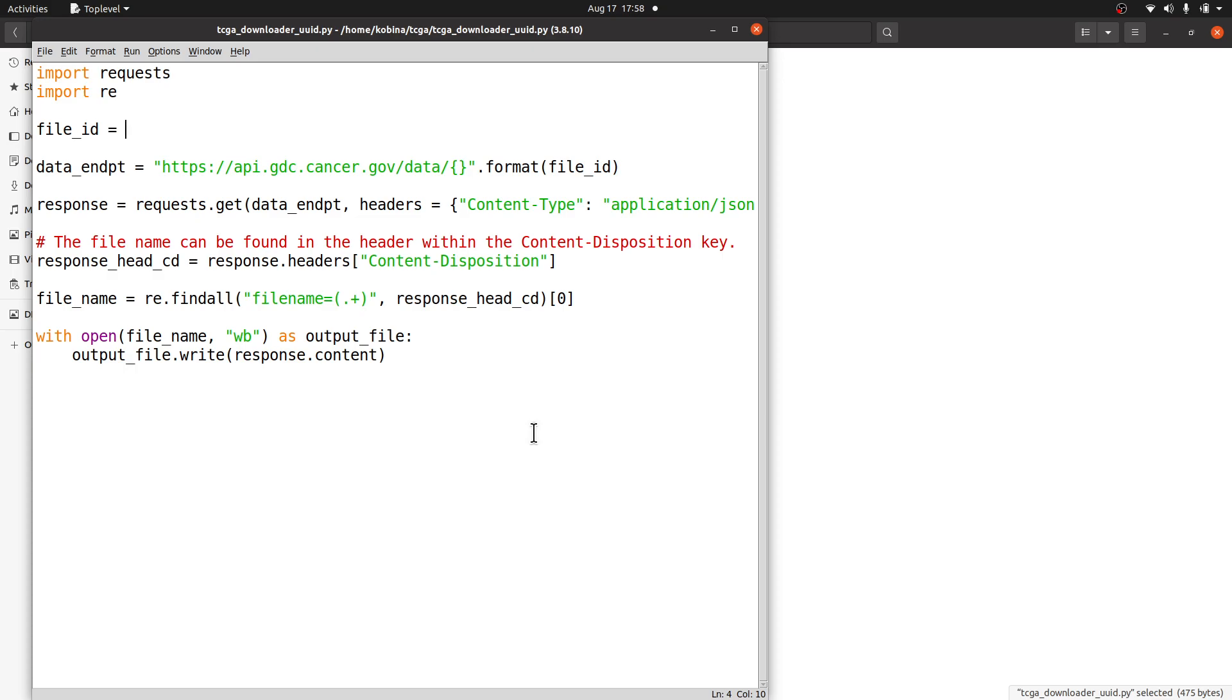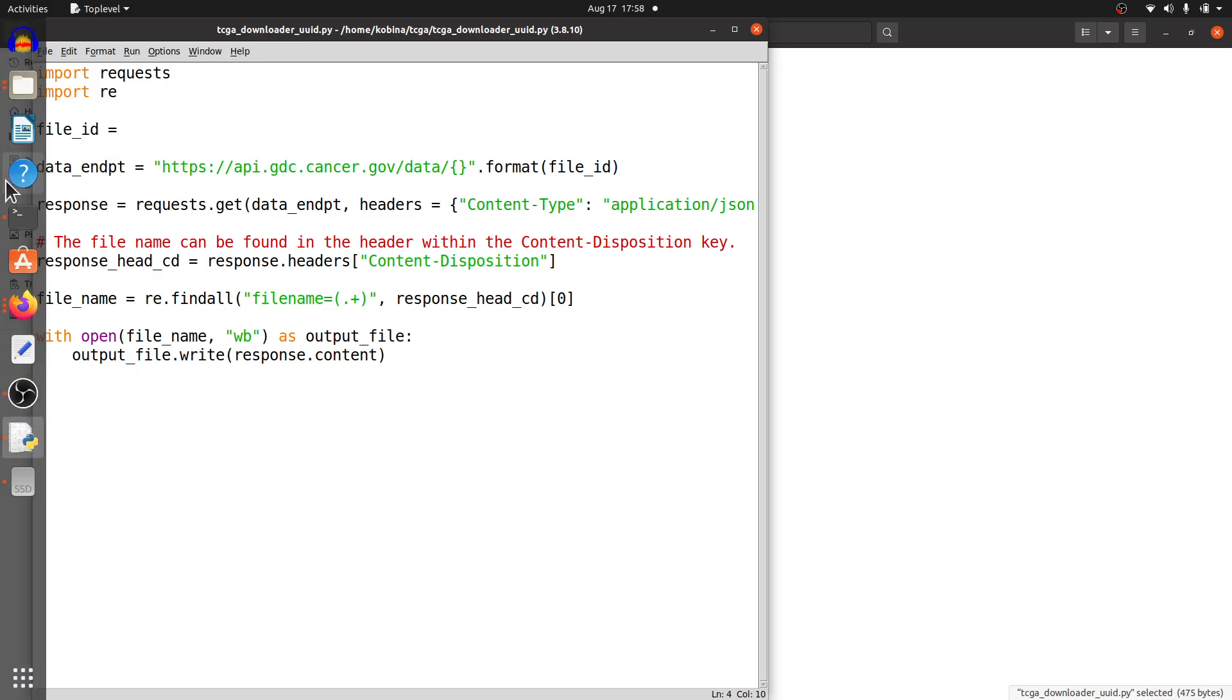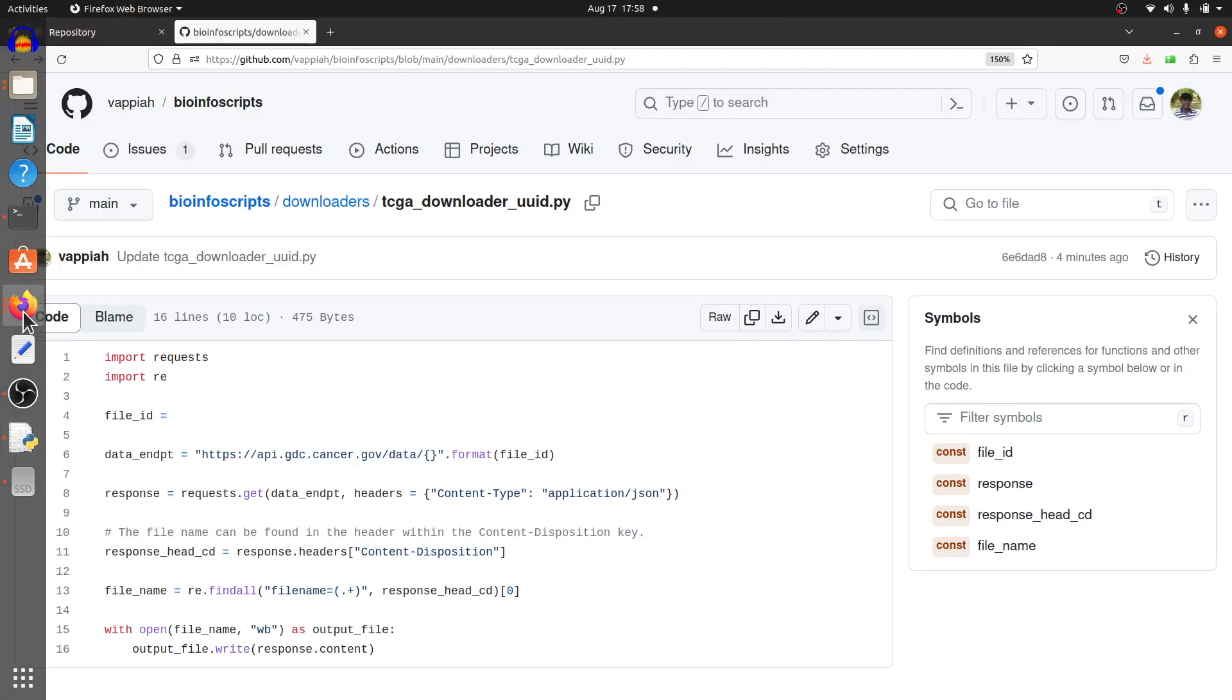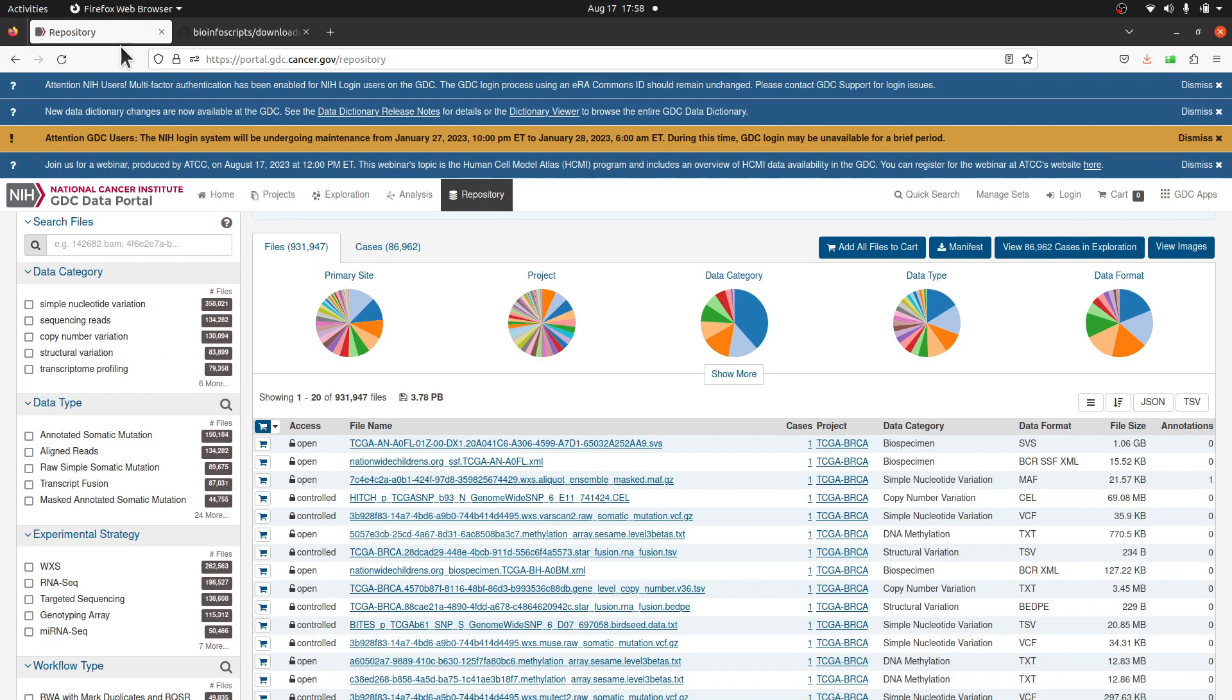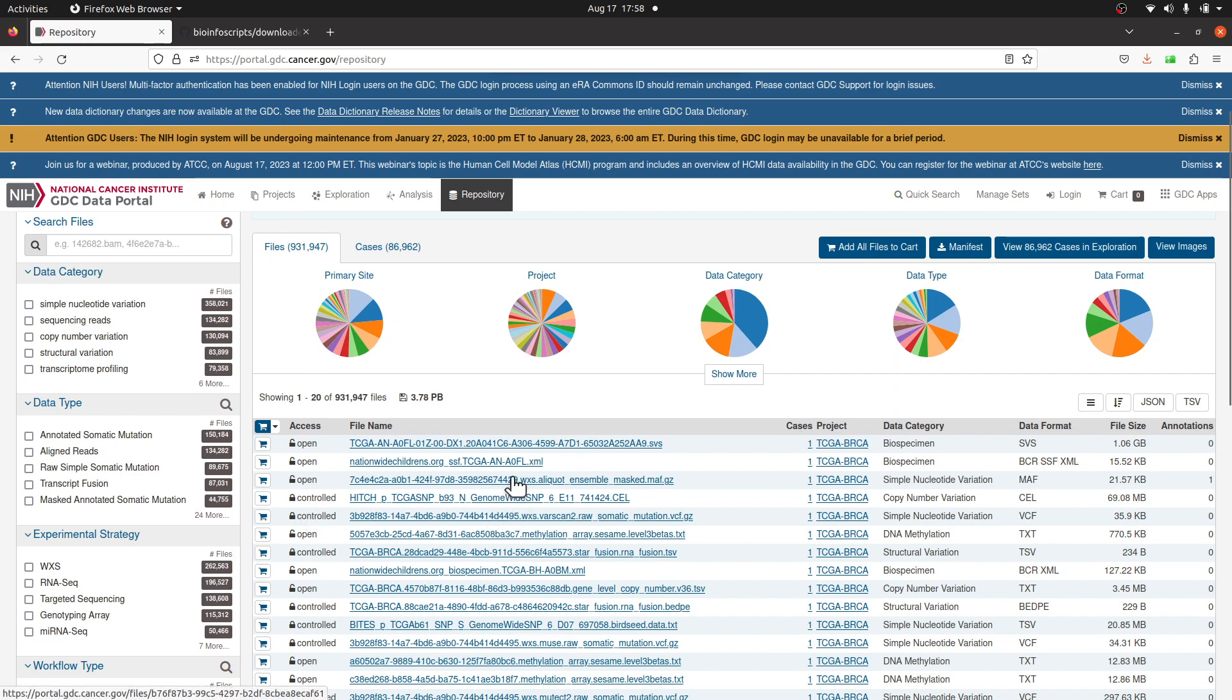Let's get back to the TCGA database. I want us to download a file, so we will get a file ID and then use it here. Let's get back to the TCGA page. Here I want us to download gene expression data.